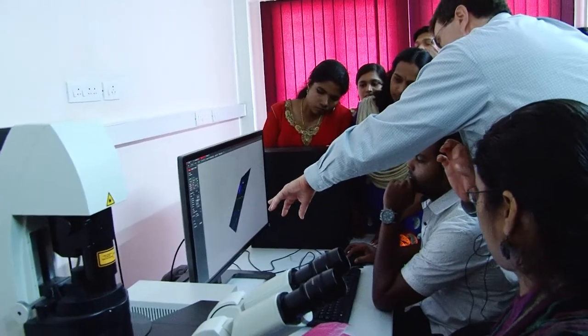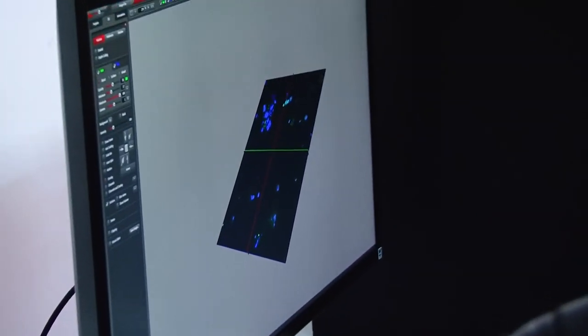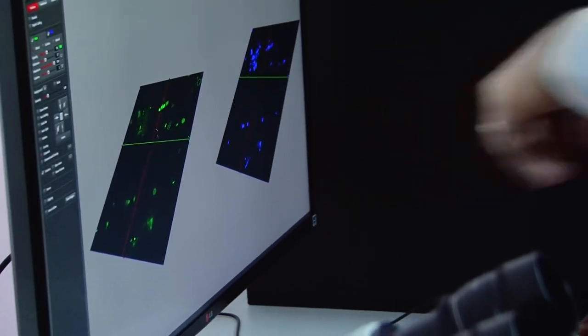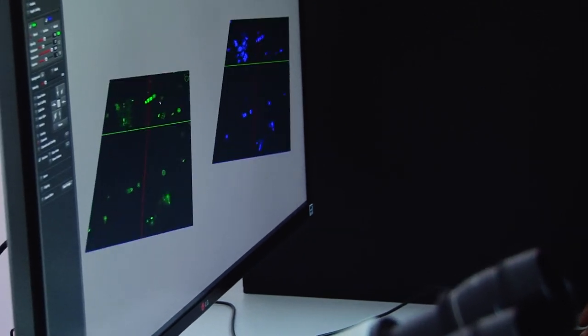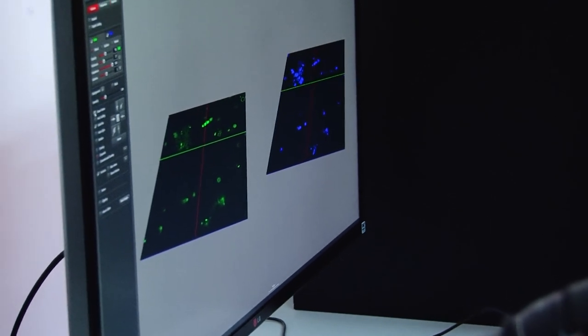Now this is nice too, because here he's looking at it, I think you're looking at separate channels, right? Okay, so he's got your green channel, and then you can move this, I think, and go through the different planes, right? Yeah. Okay, so does that all sort of make sense, what we did? It tries to highlight what we talked about in class.